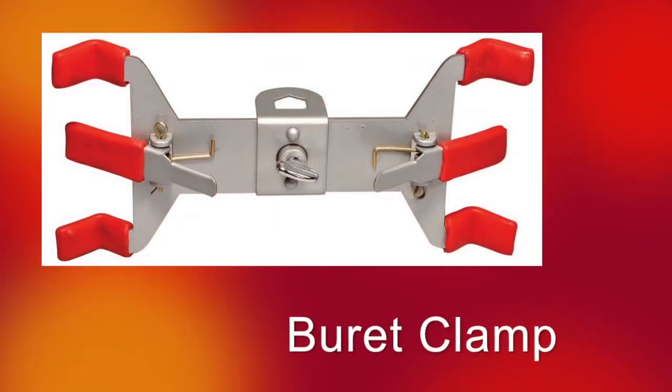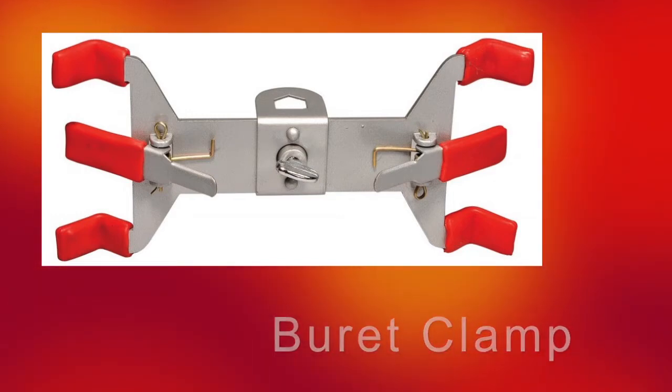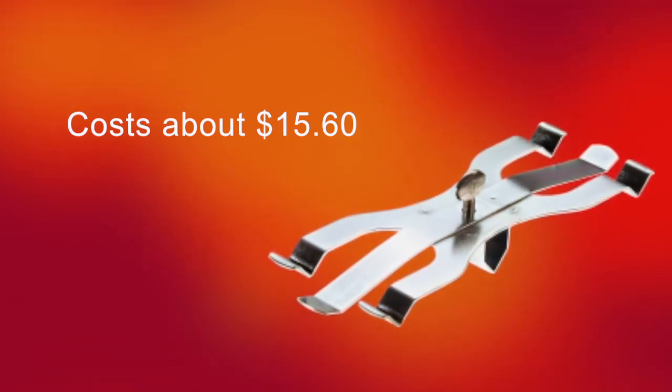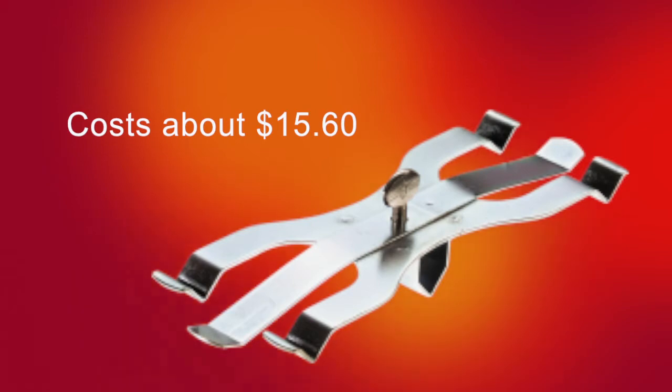A burette clamp is used to hold and secure a burette vertically onto a stand. This makes it more convenient for the chemist to perform other duties during the titration, as the burette is fixed. The burette clamps found in the lab have two clamps so that two burettes can be held.